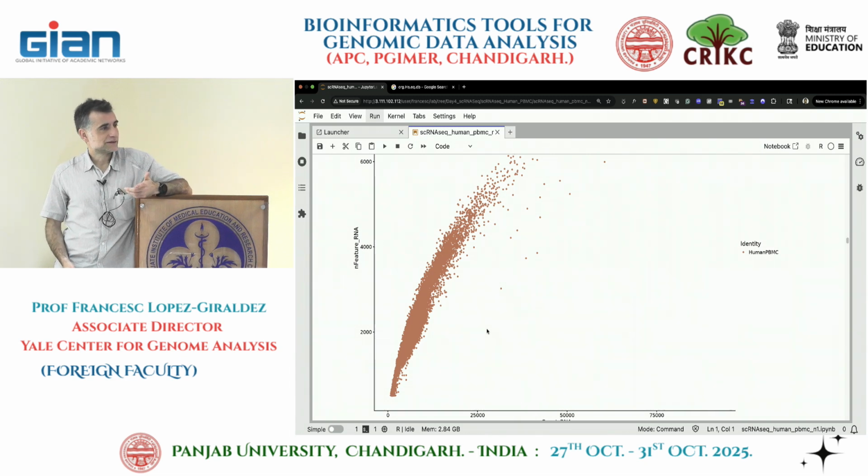I don't know, to tell you the truth. My feeling is we probably should use better algorithms to estimate the doublets, and you have them. If you Google, there's one called scDblFinder, and I remember there are others you can use to try to detect doublets instead of removing them arbitrarily with some cutoff. But it's fine too. Again, you have a lot of cells. Another thing you're helping is to reduce the spread of your counts, so the normalization also gets a bit narrower. So you make their life easier.